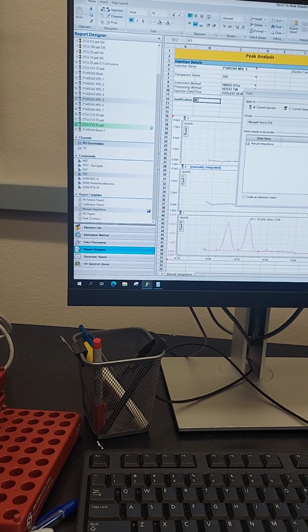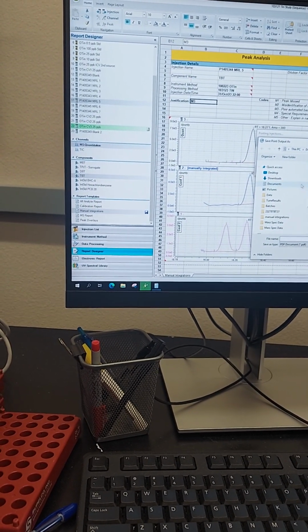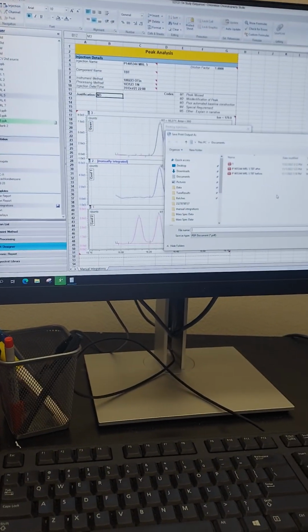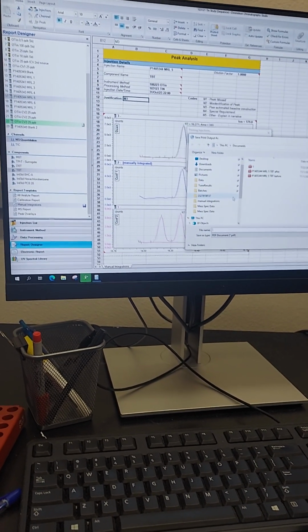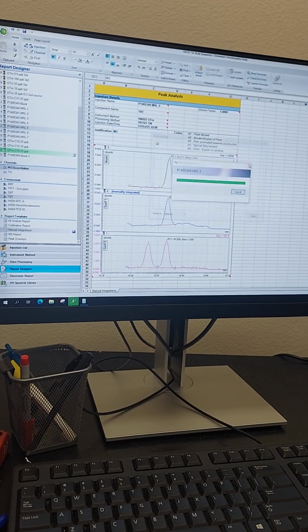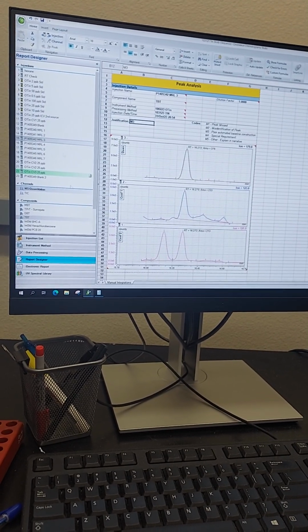PDF and okay. And then where, when you click go? It'll save wherever you save it. So right now it's set to these documents, but you could put in your flash drive, because this one's not connected to the network. Okay, I got it. All right. I think that's all the manual integrations we need.